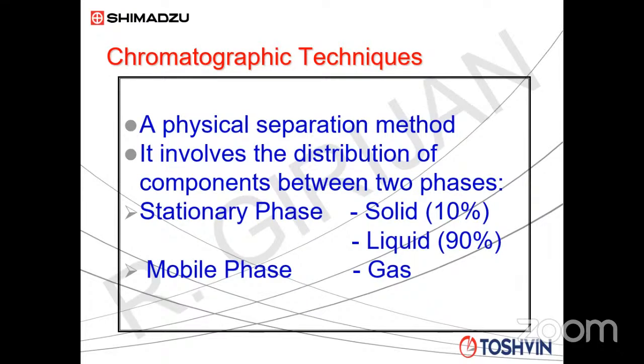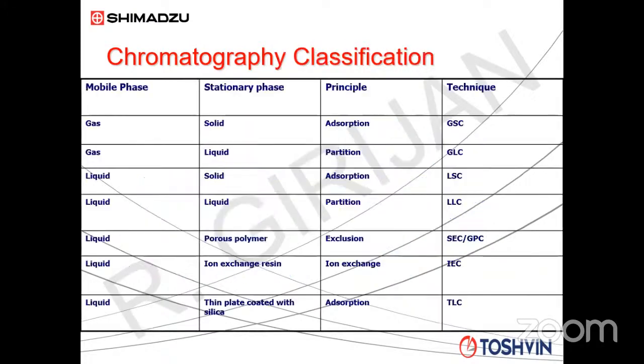Whereas a solid stationary phase has got a very limited segment for application, especially gas analysis. When it comes to very complex gas analysis, it can be refinery gas separation, hydrocarbon separation, or noble gas separation. Any type of gas analysis, we prefer to use a solid stationary phase. So there is a very specific segment. That is the reason why I am giving a very small weightage, 10%, to the solid stationary phase, whereas liquid is given 90%.